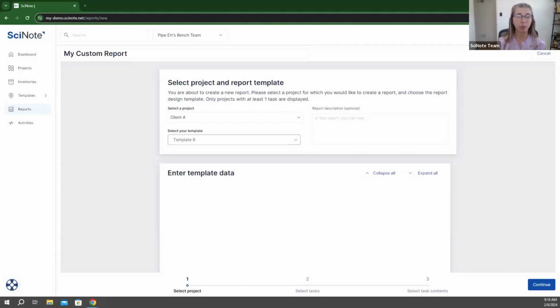Then you can save that report seamlessly back to that inventory item. Or you can just keep it with your records, so that way you have ease of access and it's all located in that one area for review, to change as maybe the project is changing. You're not going to be saving it elsewhere on your desktop, and then you're like, where did I save that? Where can I find that? It's all in one spot.